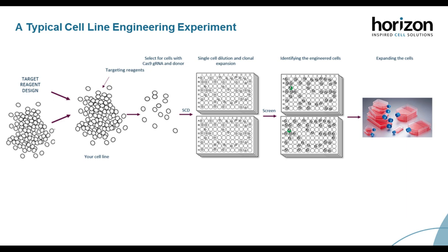The range is so large, and it can actually be much longer, because I've had a gene engineering experiment that has lasted over a year. This is because it depends very much on the cell line that you will be using and the gene that you will be targeting.